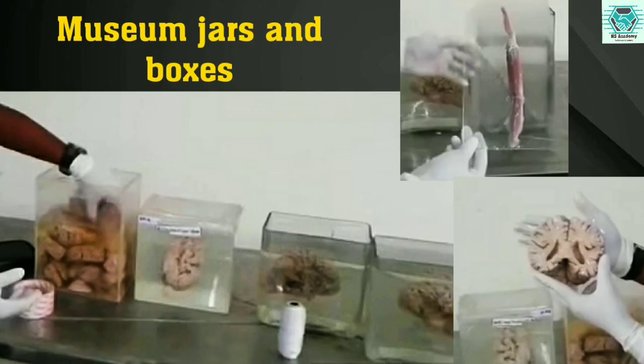Now, the jars and boxes used for the museum technique. The boxes are called perspex boxes, which are lab-made or commercial. Glass jars and boxes are also used. The specimens are sometimes attached to a center plate.